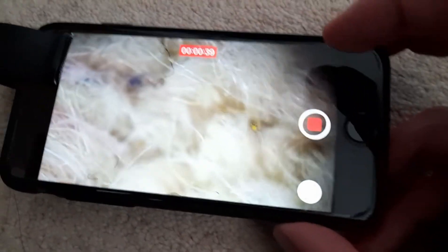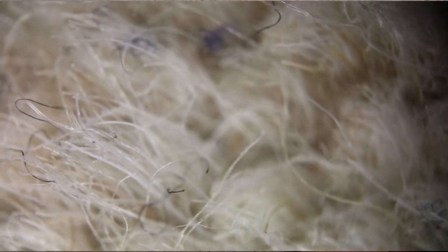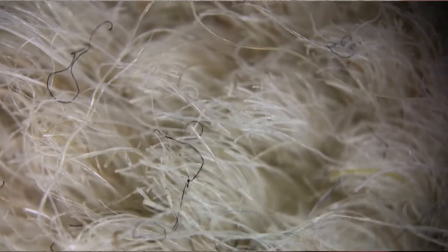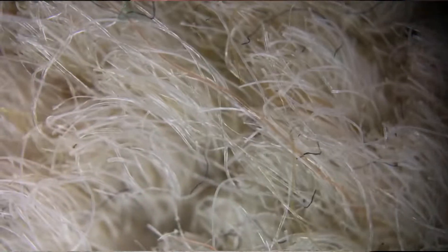Now we've got the floor here — I put it on the floor. I'm probably going to see some little weird bugs in a minute. Again, I'll attach the footage from the actual phone where it's actually crazy how well it zooms in and works.